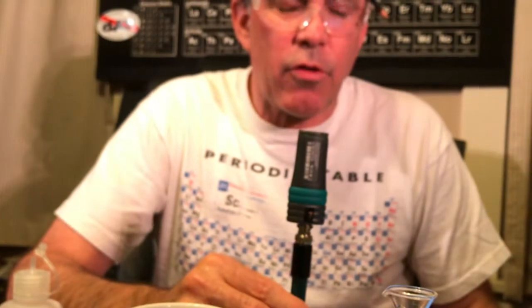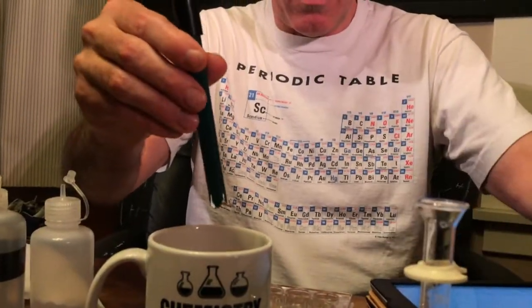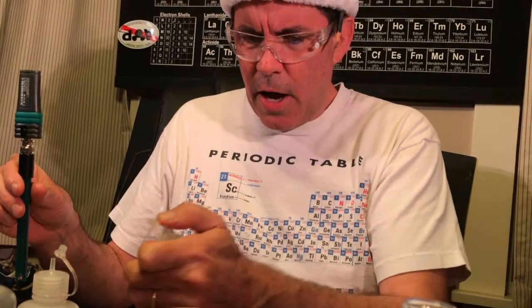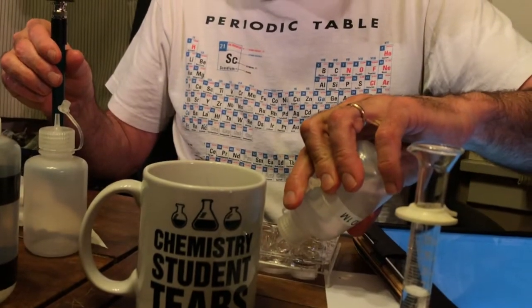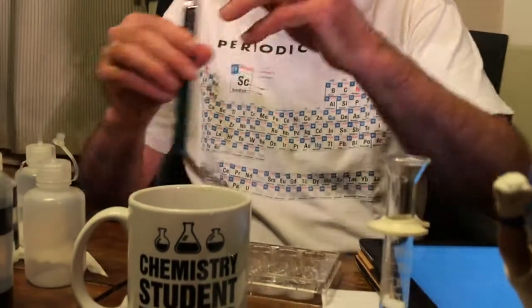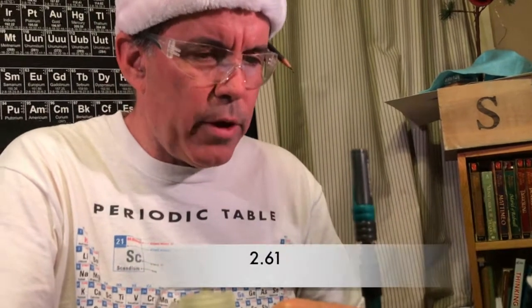Okay, so the pH is 3.20. Now I'm going to wash off the tip. And I'm going to take some 1 molar acetic acid. I'm going to put it in another well, and then we're going to measure the pH of that solution. So do you think the pH is going to be higher or lower? This time the pH of 1.0 molar acetic acid is 2.61.